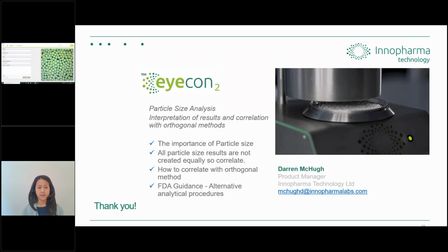With this inset here, you can see the benchtop that I showed you earlier. We're looking at some cellets here. They're not sitting on top of each other. This is purely because of the static image analysis, where the stage will move, stop, and the camera takes a single image and analyzes it. It's not so critical for dynamic image analysis, which is what we use for our inline settings, which is what you're seeing here now happening with the GPCG2 on the coating process.